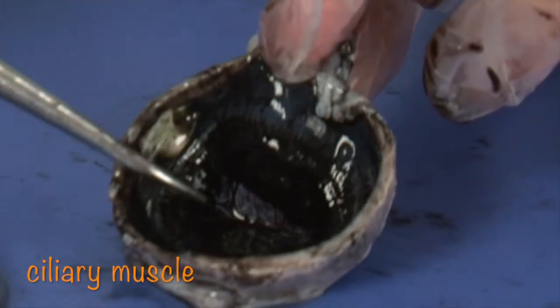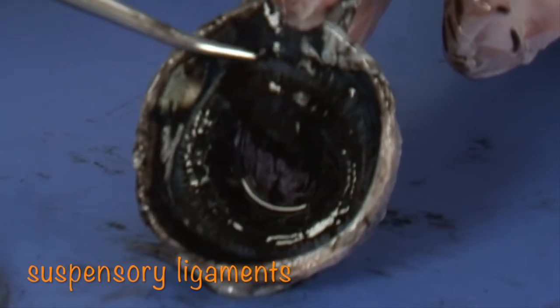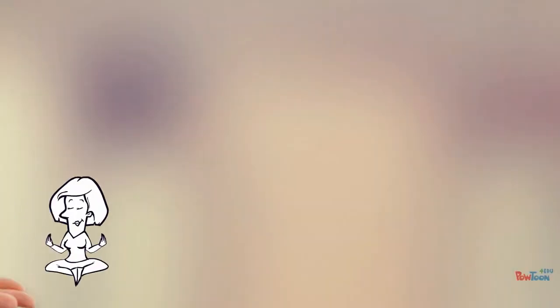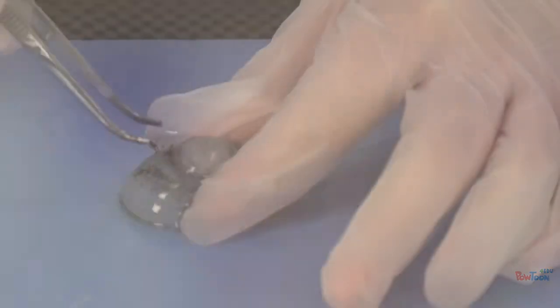Ciliary muscle, suspensory ligaments, observe the functions of the lens and the aqueous humor.